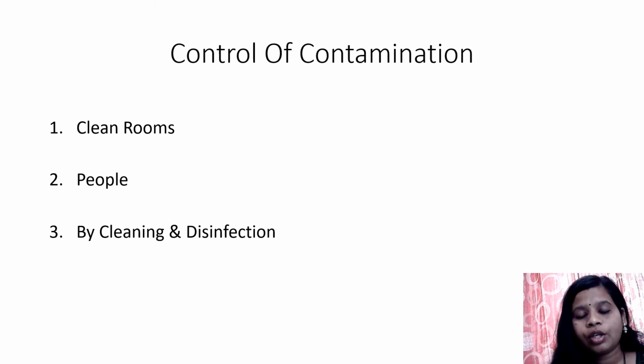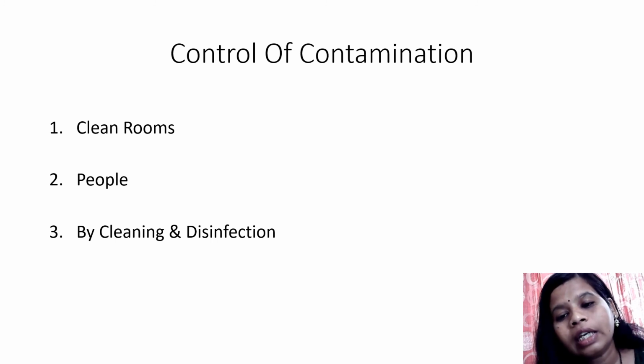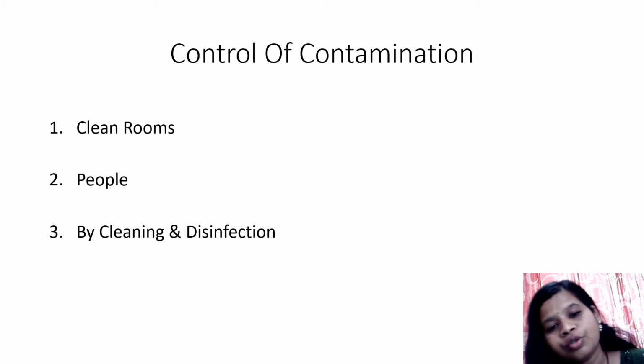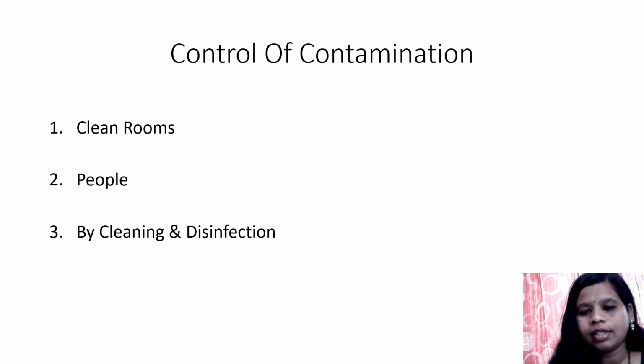Along with this SOP, the main requirement is that cleaning is compulsory first and then the disinfection, and for whatever liquid material we are using for disinfection, the dilution should be made fresh. It should not be stored beforehand, and using previously diluted material for disinfection should not happen. As well, if something is flooded on the floor, it should be covered up and mixed with the disinfectant, and then thrown, because sometimes the liquid may act as a source of contamination in the aseptic area.